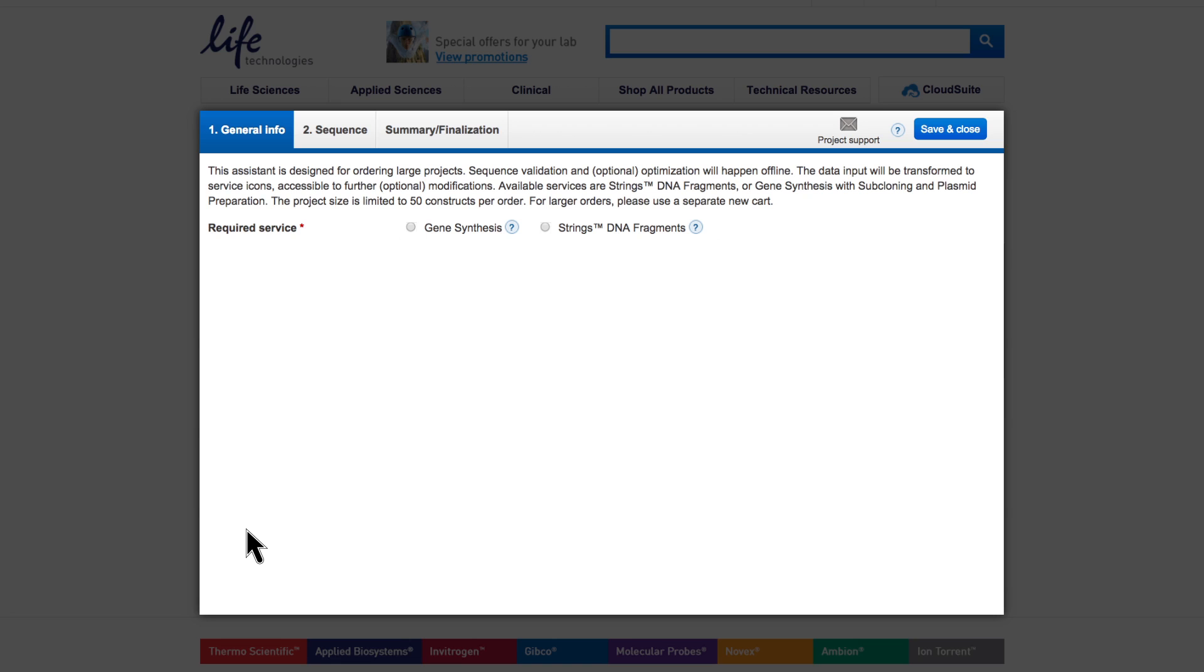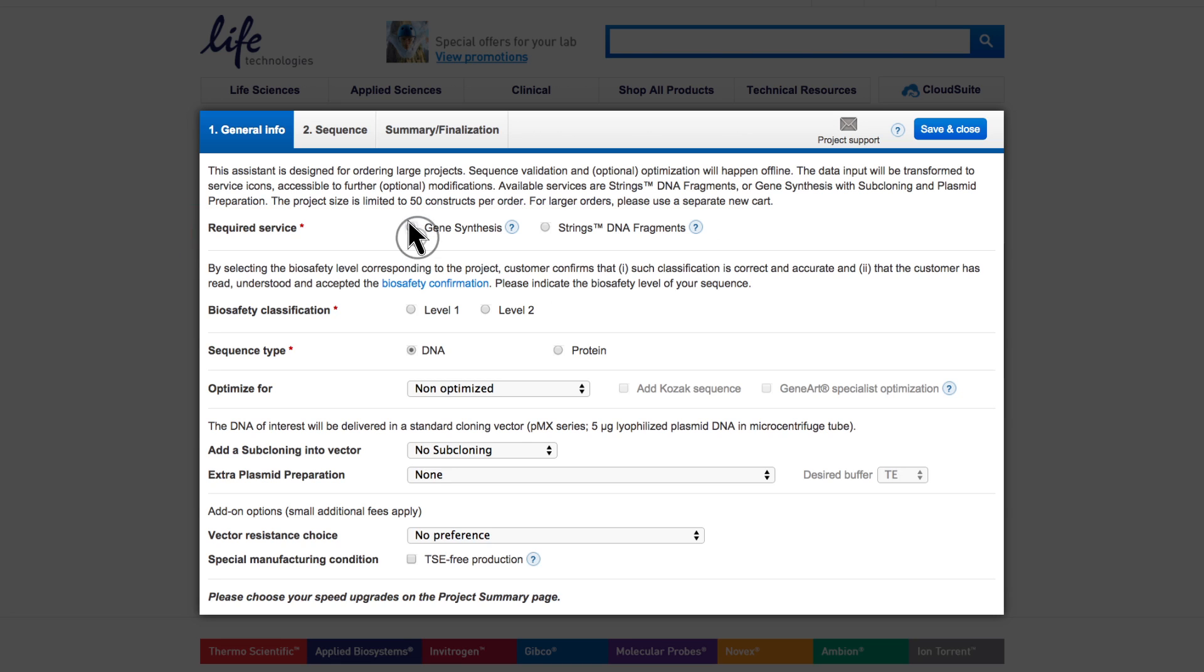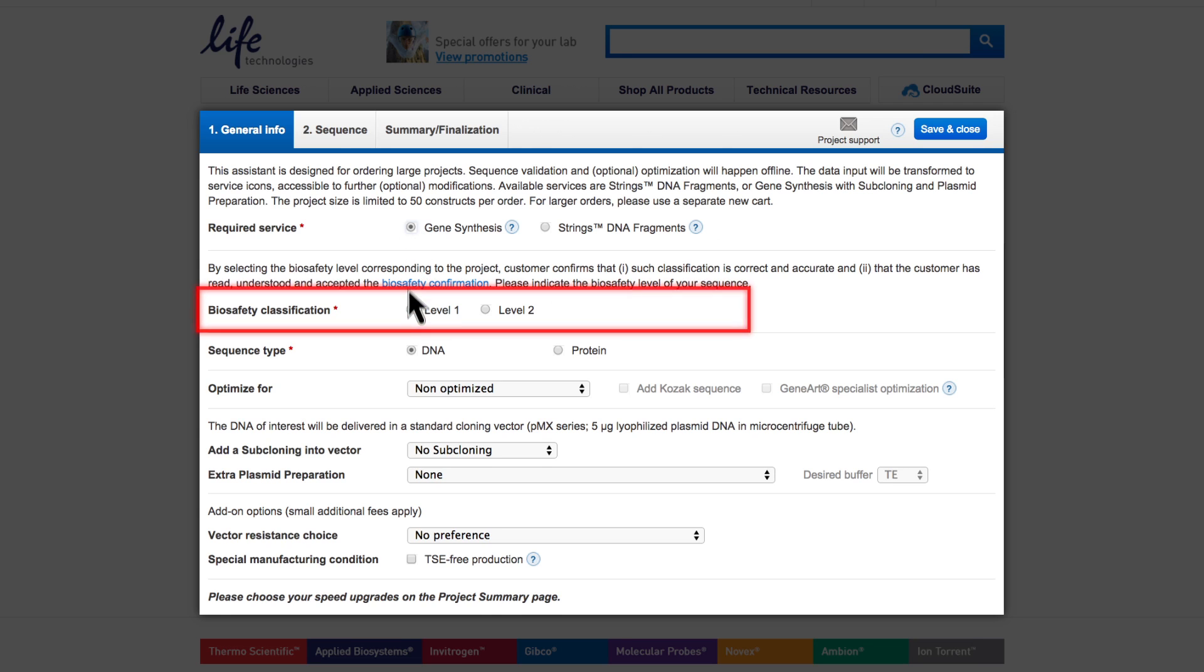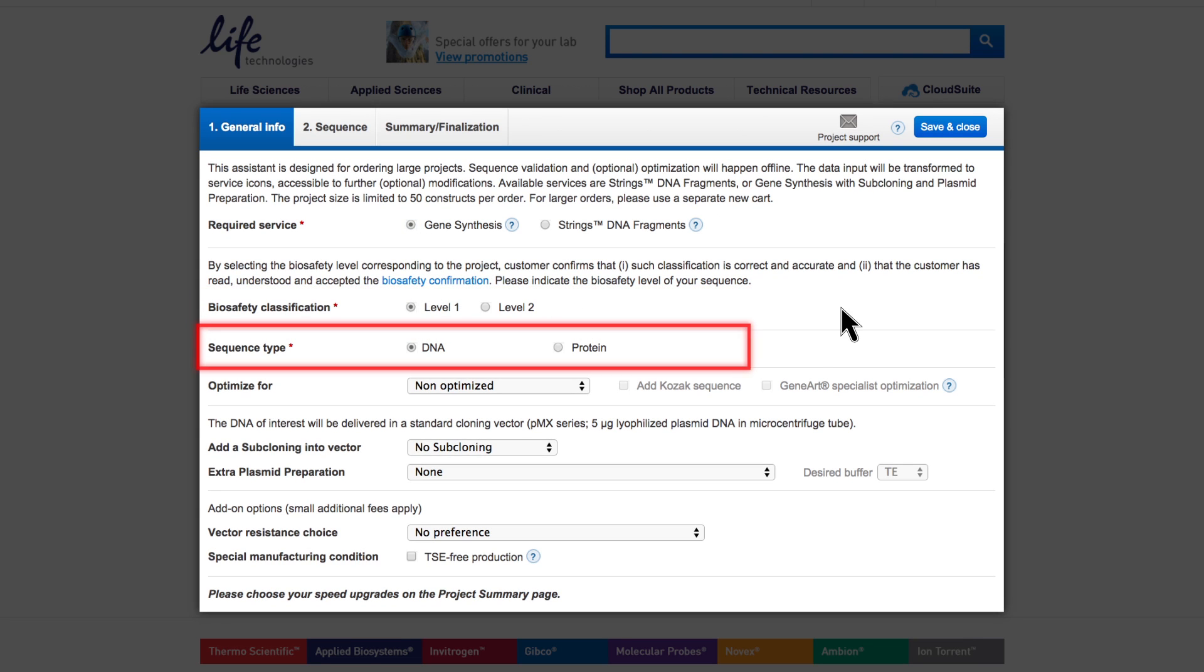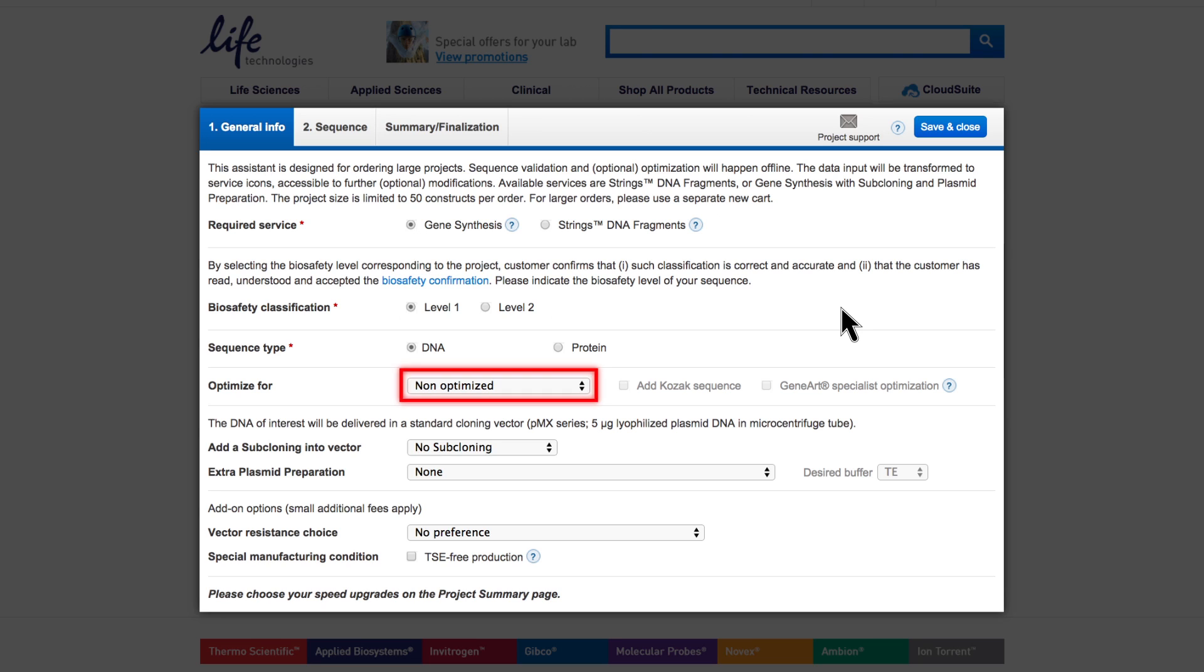Select whether you want to order Gene Synthesis or String's DNA fragments. We will continue with Gene Synthesis and show String's DNA fragments later in this tutorial. For Gene Synthesis, choose the biosafety level and indicate if you will enter a DNA or a protein sequence. For protein sequences or for gene expression optimization, your expression host is required.